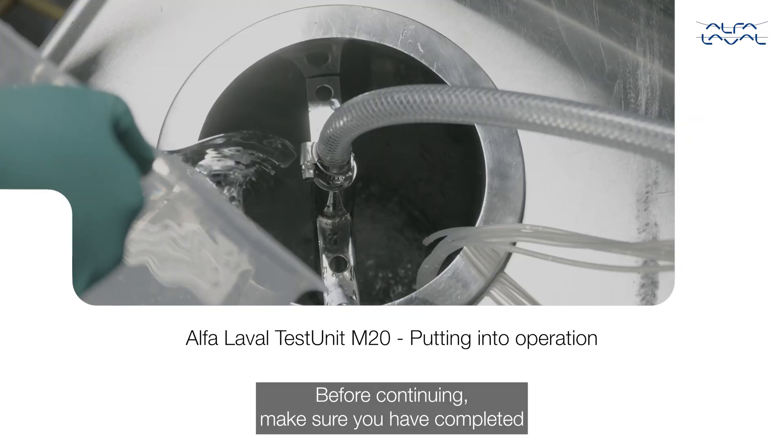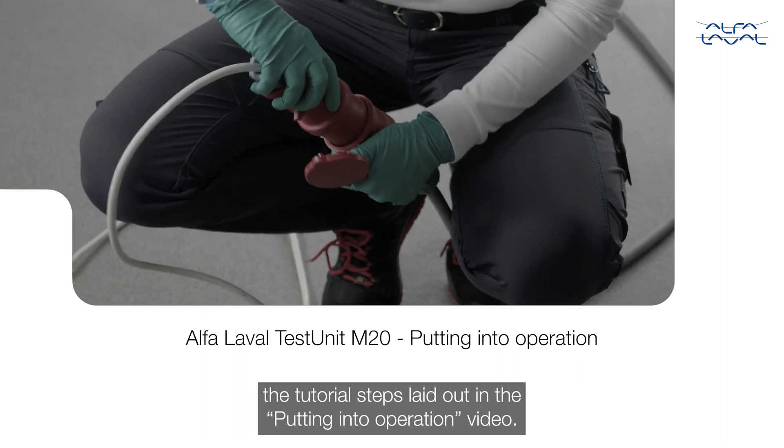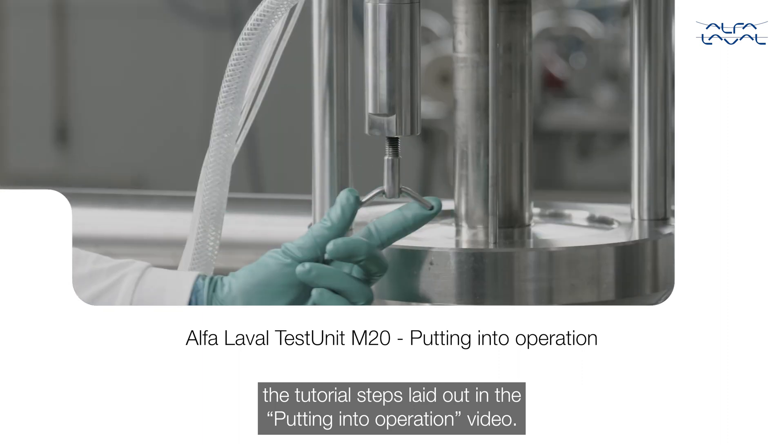Before continuing, make sure you have completed the tutorial steps laid out in the putting into operation video.